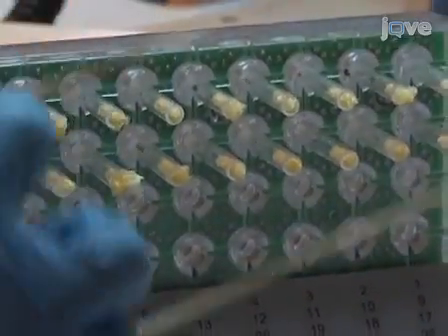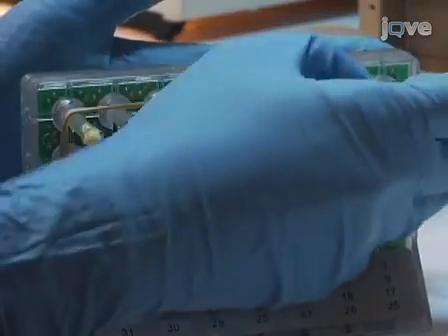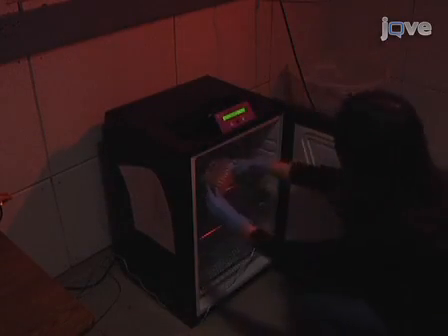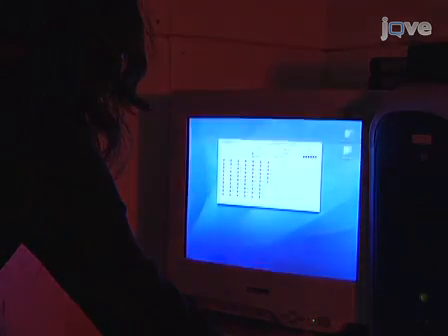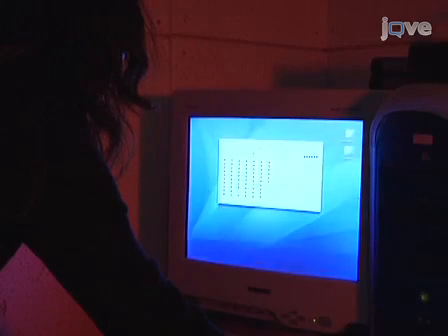With the newer, more compact model of the TriKinetics monitors, it is necessary to hold the tubes in place with rubber bands to ensure that the infrared beam passes the tube at the center position. Finally, put the activity monitors into the incubators and hook them up to the data collection system via the telephone wires. Check using the DAM system collection software that all the monitors are hooked up properly and that data is being collected from each of them.